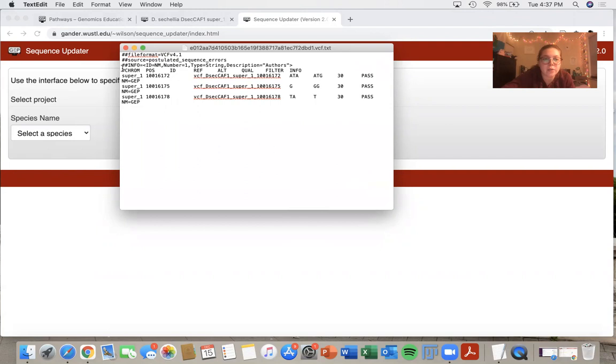So in this row right here, we have chromosome, position, ID, reference, alternative, quality, filter, and info.